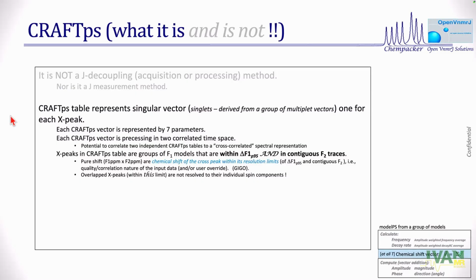And you can come in and say, okay, just like you would say, I want to integrate these 2 together, or integrate this and integrate that and add them together to generate my QNMR, you can simply say, I have 2 cross peaks in there, draw a box around it, and make that into your rule. That rule is applied only to those 2 drawers in your cabinet. So you are essentially saying those 2 drawers in your cabinet should be together because I say so. Because you, as a chemist, say so. So there is some room to override even that one rule that we apply.